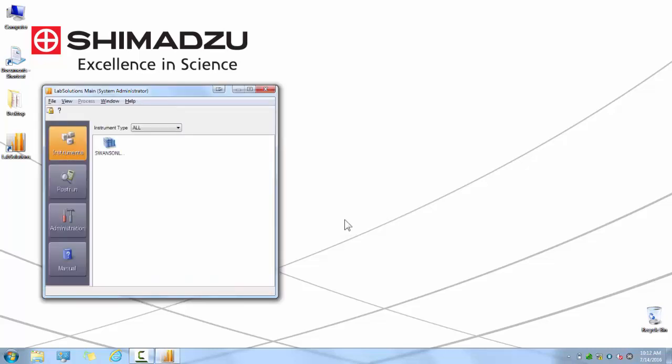If at any point you need contextual help when running LabSolutions, click in the area you would like assistance with, then press F1 to bring up the contextual help manual.